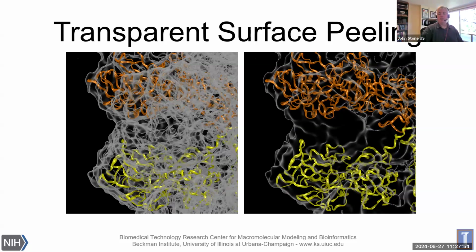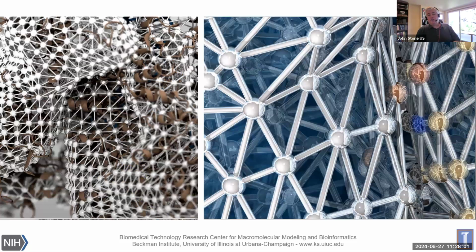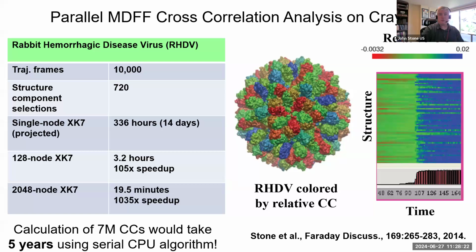So this is something that's built into the Tachyon renderers that are in VMD itself. You can also use the ray tracing engines, and you can have reflections. So you can make a chrome type material, and then you can make very, very aesthetically pleasing visualizations like these. These are some zoom ins on a large finite element mesh surrounding a protein structure.